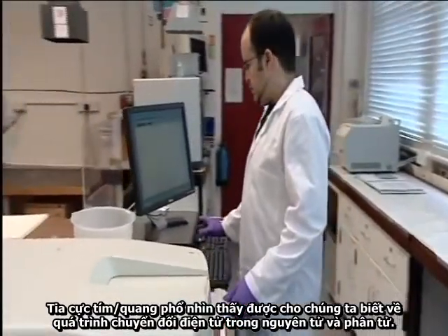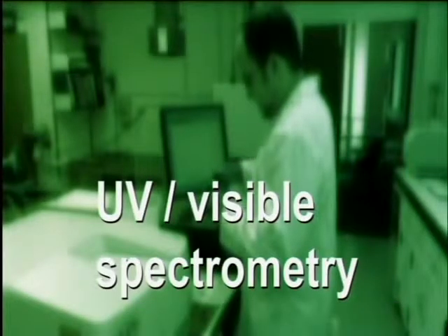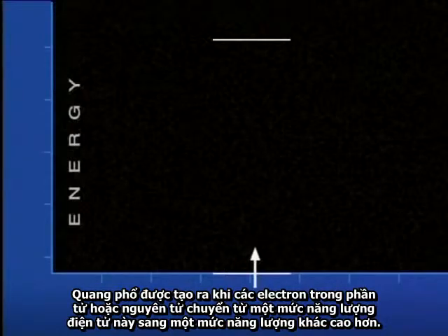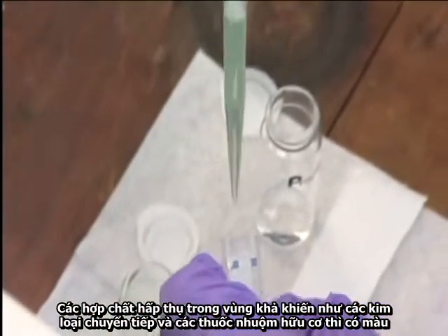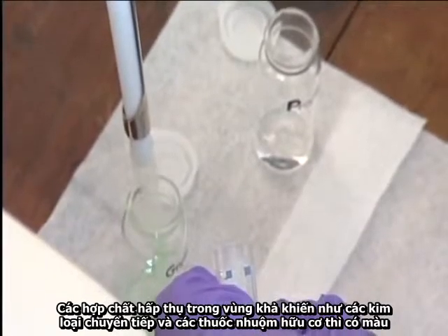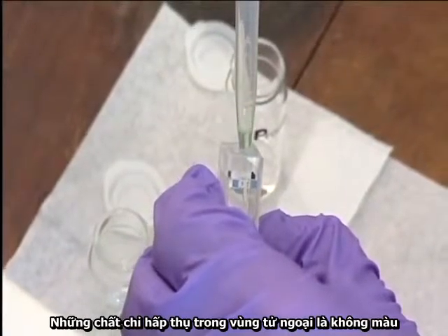Ultraviolet visible spectrometry tells us about electronic transitions in atoms and molecules. Spectra are produced when electrons in molecules or atoms move from one electronic energy level to another of higher energy. In doing so, they absorb energy equal to the gap between the two levels. Compounds that absorb in the visible region, such as some transition metal compounds and organic dyes, are coloured. Those that absorb only in the ultraviolet region are colourless.